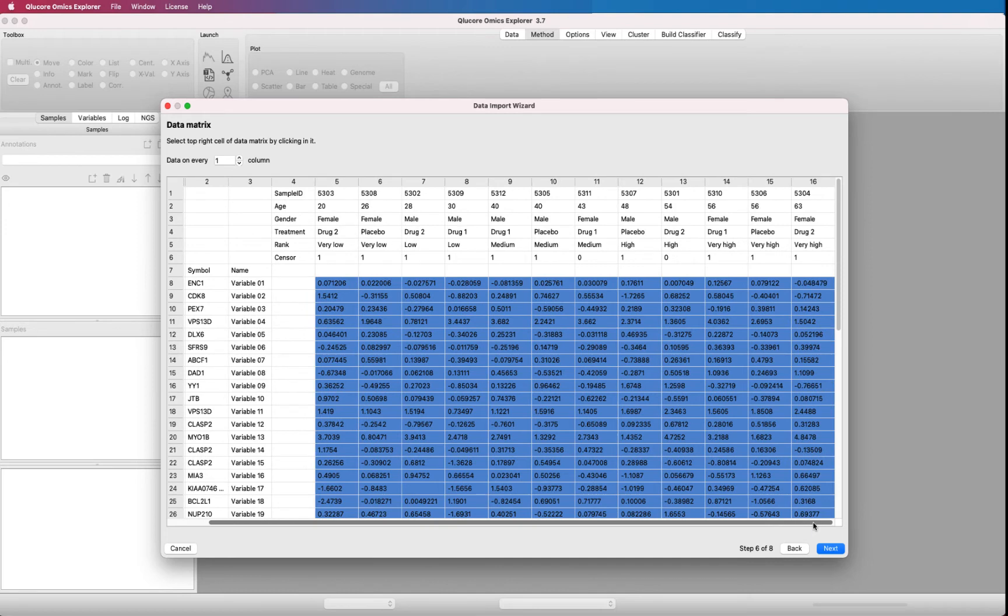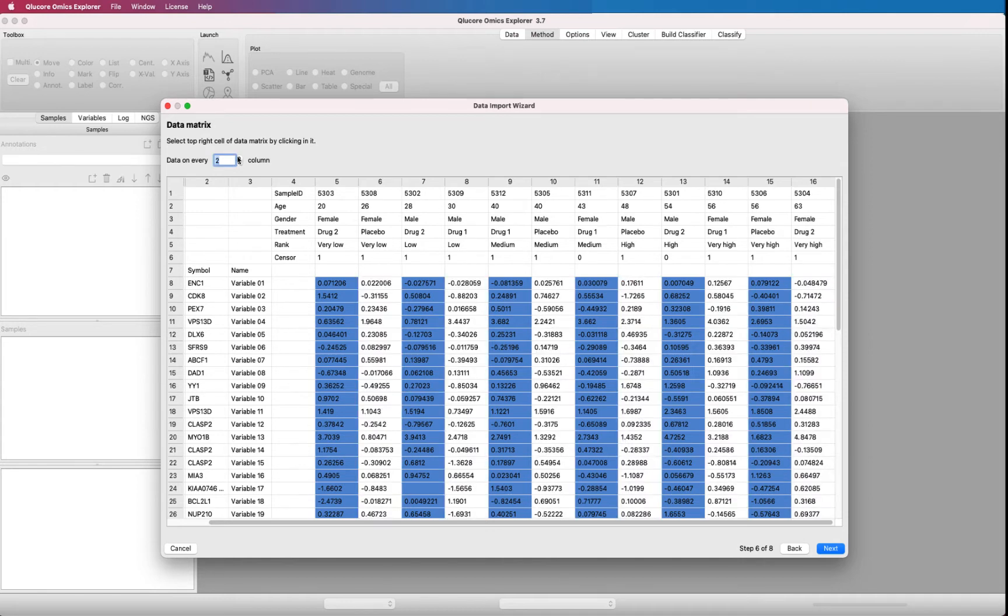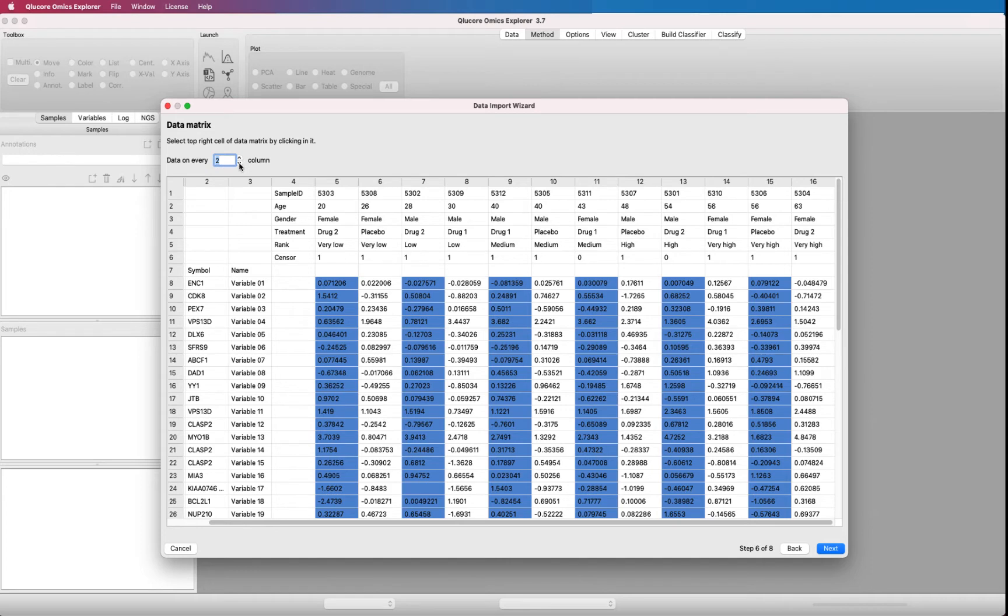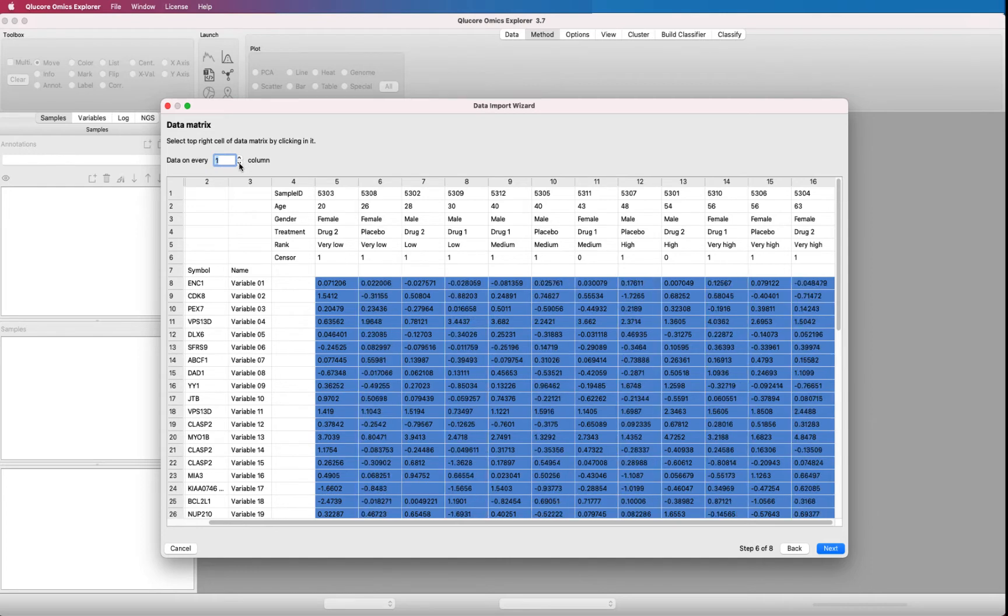Some instruments generate multiple columns for every subject, and the option not to import every column can be very useful. Use a spin box to select only every second column. The color code is updated to reflect the new setting. But in this case, we want to import all columns, so we set the spin box to 1 again. And then we press next.